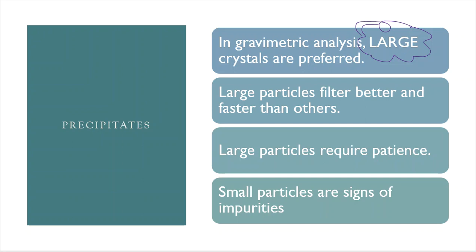And if you end up with small little grains of sand, that typically means that you rushed a process through. That typically means that the crystals are slightly impure. They're not going to give you very good results. They might get you close where we can put good job, but try again type of thing on you. But large, big, needle-like crystals are going to be the way to go here. So big, large chunks are going to be better than super tiny little small grains of sand.